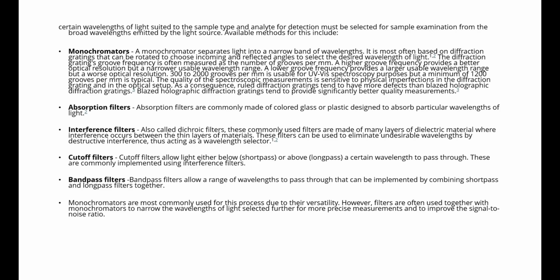Most commonly, monochromators are used so that lambda max, that is the absorbance maximum, which is the characteristic property of any analyte molecule, can be determined, and you can detect the purity of the molecule, the concentration of the molecule, structural details, etc.